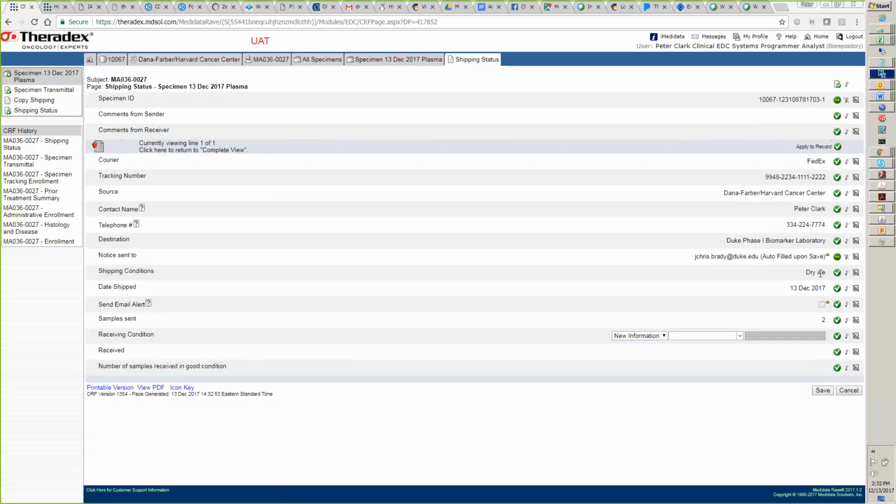in dry ice. Now, if the packaging failed and something happened in the overnight shipment that damaged the specimen, you would need to enter that here. If it arrived exactly as it was shipped, you would say same as shipping. But if something happens, you would choose other and then fill in the details in this extra field here.